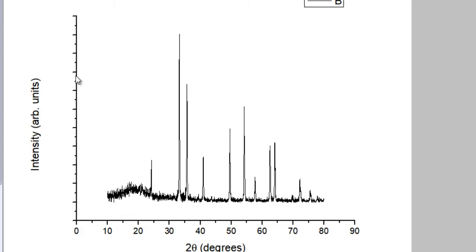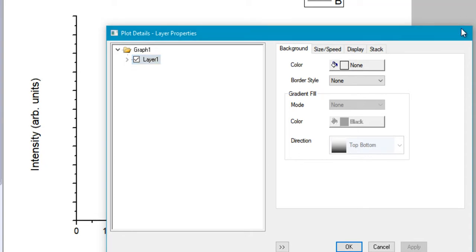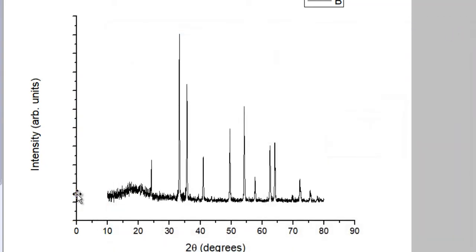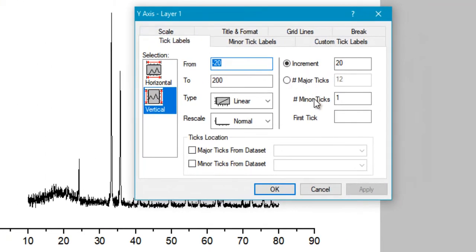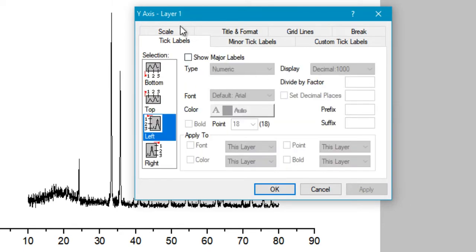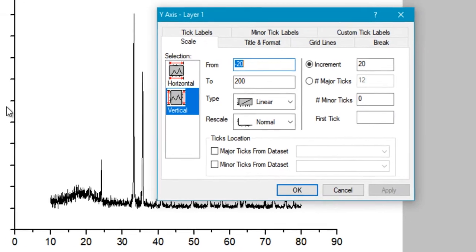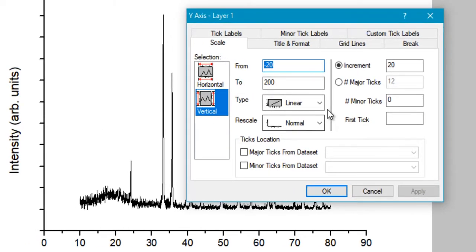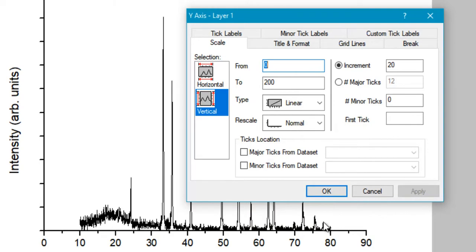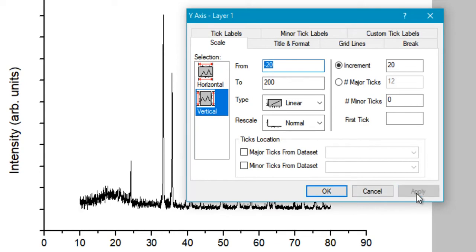You can also control the number of minor and major tick labels visible on the axis. Double-click on the axis, select 'Tick Labels,' and here you can set the number of minor ticks — currently set to one, so select zero and click Apply to remove them. You can also set the Y axis range; currently it starts from minus 20, but you can choose zero instead. Usually it's better to keep that small offset, so I'll leave it at minus 20.